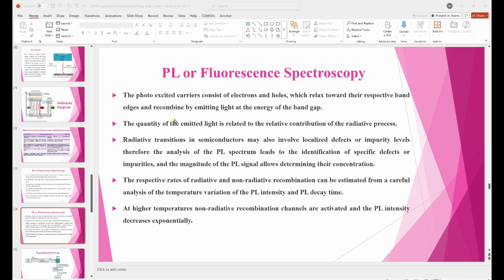Basically it amplifies it. So why is the detector at 90 degree? Why not at 180 degree? In UV visible, your detector was at 180 degree because your transmitted light is at 180 degree. But in fluorescence spectroscopy, your detector is at 90 degree. Why? Because in the sample cell, fluorescence is given in all directions. Transmitted light is only at 180 degree, but fluorescence is given in all directions with equal intensity.